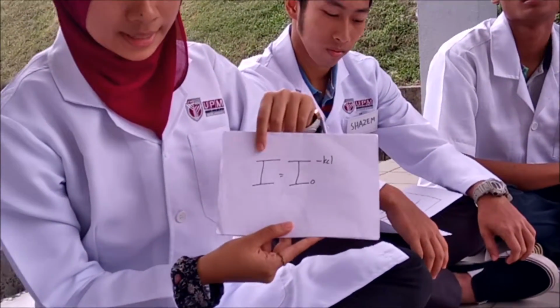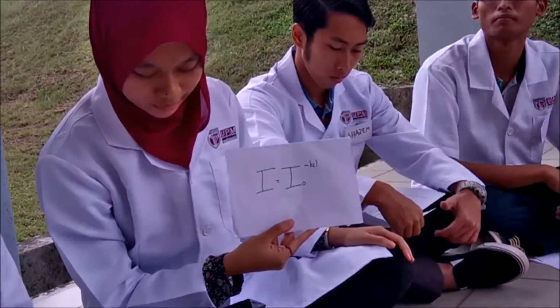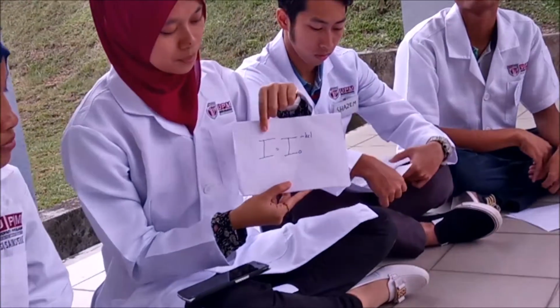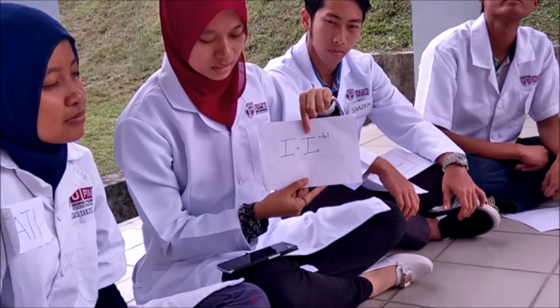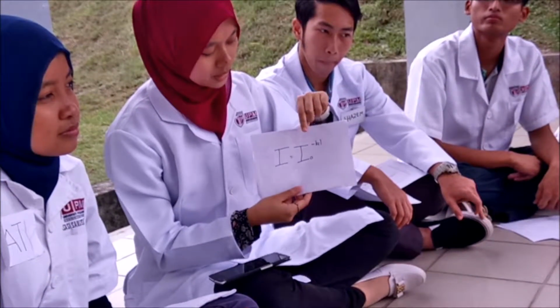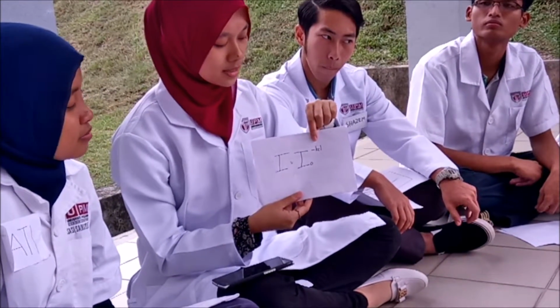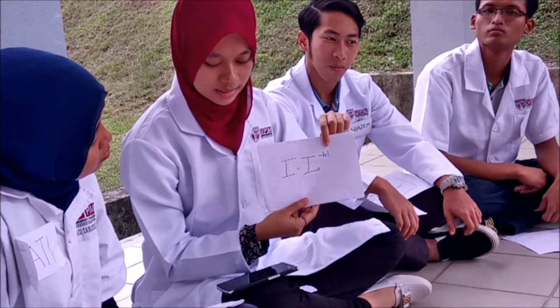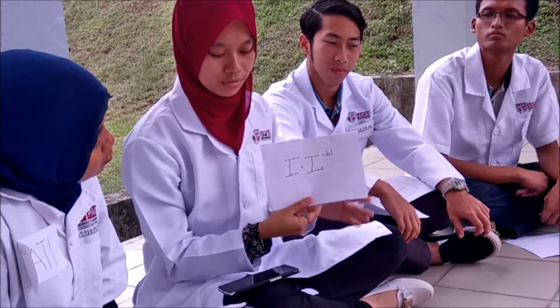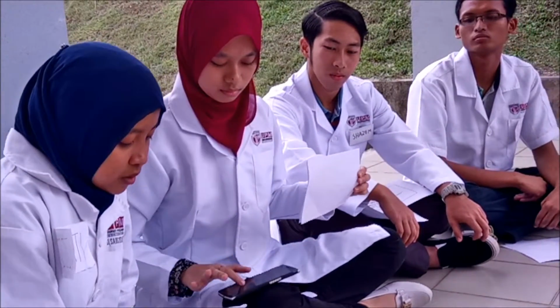The I is the transmitted light when the colored compound is added. I sub 0 is the transmitted light while using the pure solvent, negative K is the constant, C is the concentration of the colored compound, and L is the distance that the light traveled.